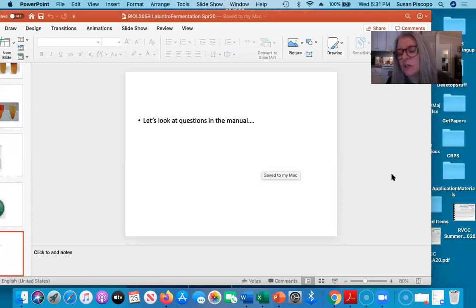So Kirsten is asking, how do you know if there's growth? In the pictures that I put for you in this slide set, you don't know. But I'm telling you that for all of our results today, you can record growth as occurring. It's really important when you interpret metabolic tests that you first check for growth. If you pull a tube or a plate out of the incubator, and you've got a color change and you don't see any cells growing, you've probably got a problem with the test. We always check for growth, okay?